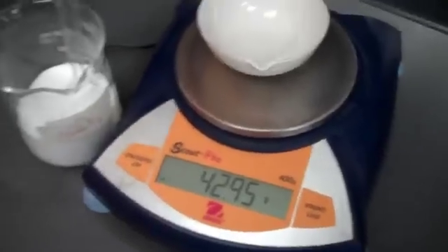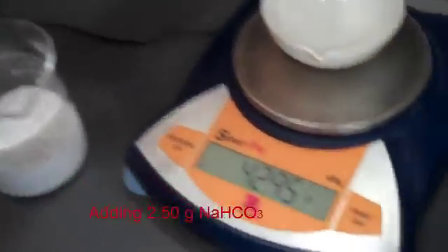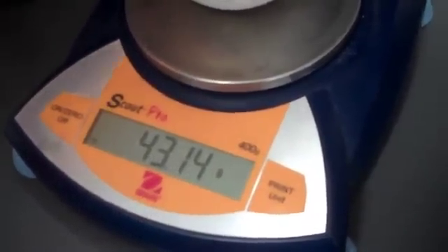Now we've got to add 2.5 grams of sodium bicarbonate to the dish. The new combined mass should equate to 75.44 grams.